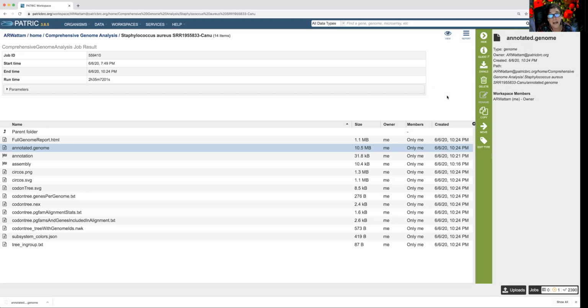If you open it up, you'll scroll through it. It's gigantic and goes on. Well, it's not gigantic in size, but it scrolls down and gives you information about every gene. It's a JSON, which is a JavaScript object view of the data.